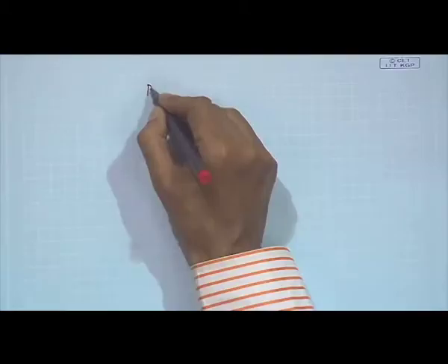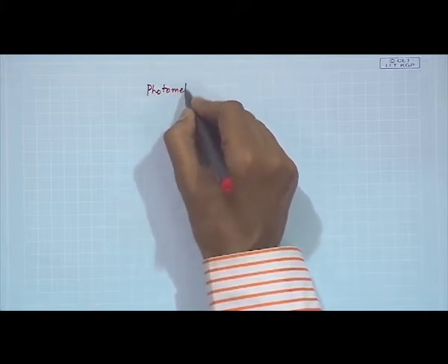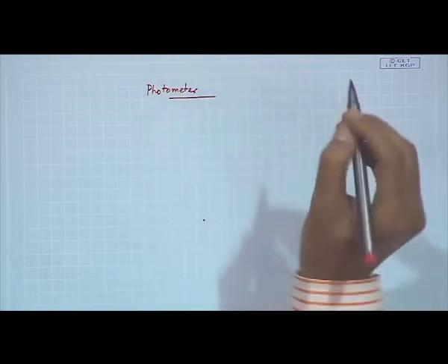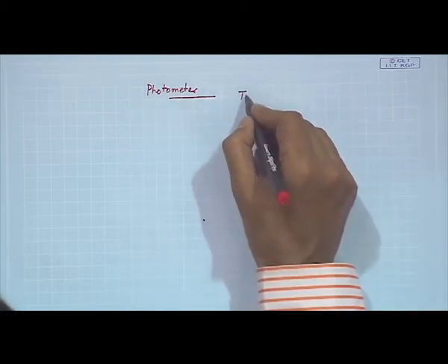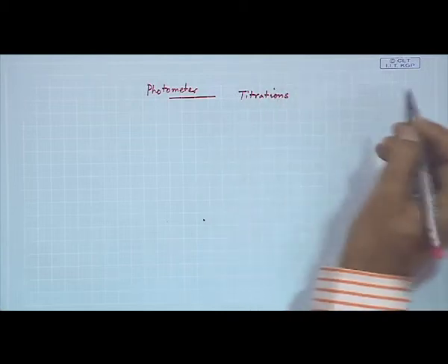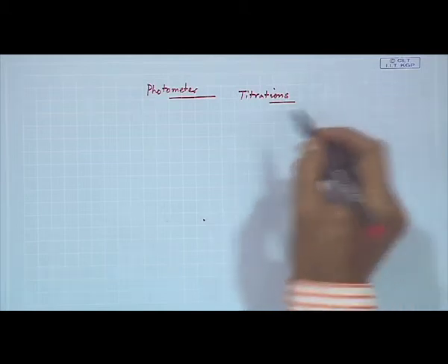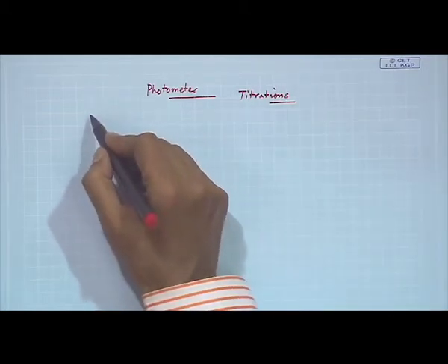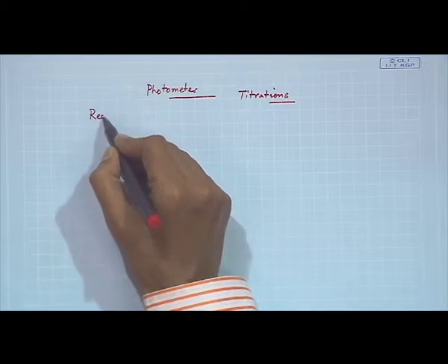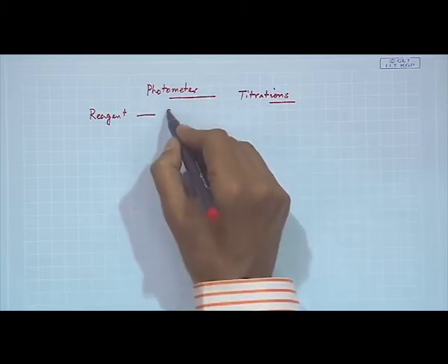Hello, welcome to this class of titrations where we are talking about photometric titrations, because we are using a photometer to identify the endpoint of some titrations. So, now we will introduce something where we can see a particular reagent which can be a complexing agent.